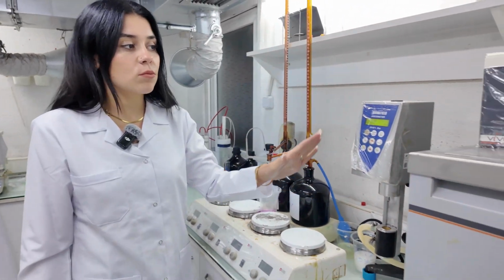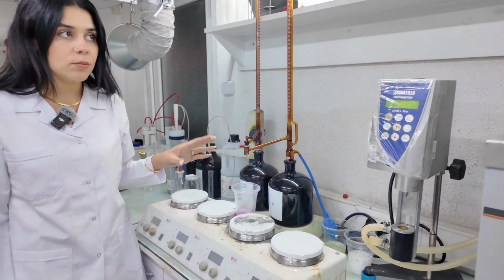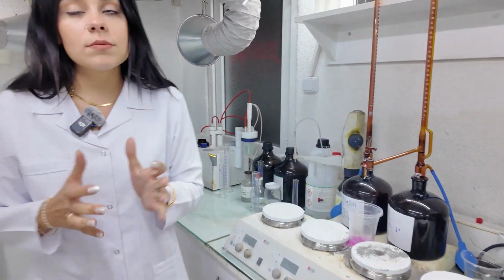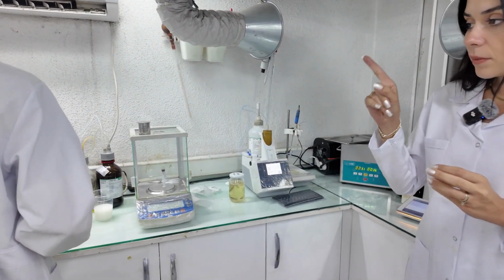Our viscosity device measures viscosity. We do titration for acids and OH here. Our NCO device is available. We measure our NCO with this device. Mr. Musa will soon check the moisture.